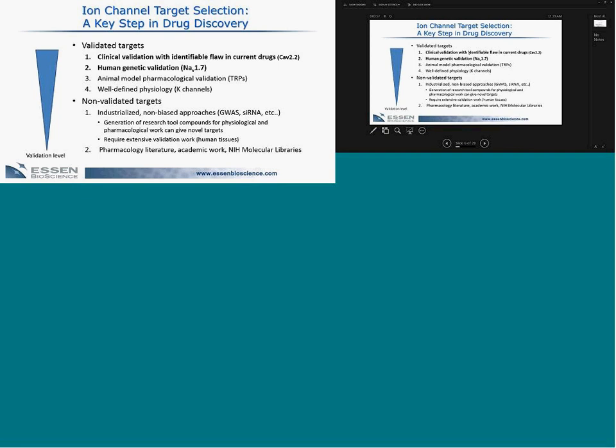And the reason this is important is that these conformational changes in gating can be driven by physiological or pathophysiological activity. So, for instance, in some states like epilepsy, where there's a lot of neuronal tone, and the cells tend to be depolarized and fire fast, cells that have sodium channels, say, or other types of channels that are more in open or in activated states could be specifically targeted.